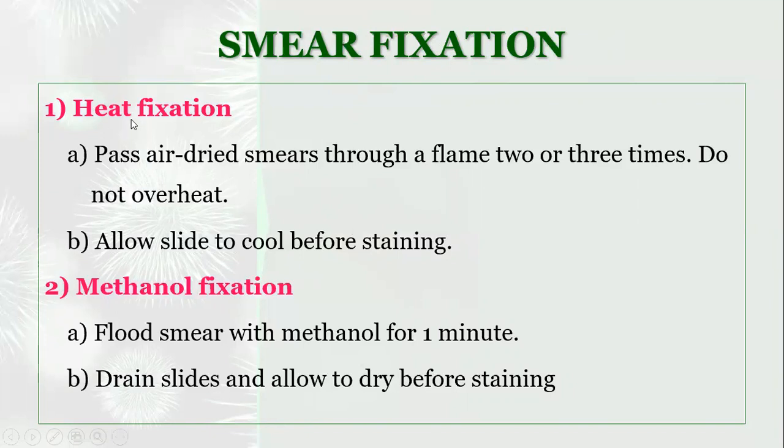Once it has been heat fixed, it should be allowed to cool before the stain is added. Why? Because when the slide is hot, if you add the stain, then the stain sticks to the glass slide. It should not be like that. So it should be cooled before it is used for staining.